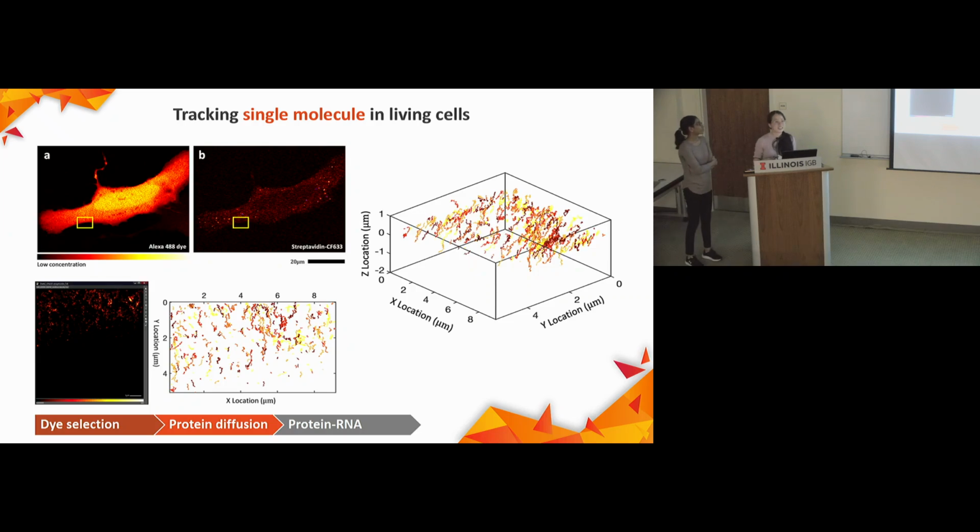Okay, dokie. I wanted to comment on your question. So they went through and did all the things they said about making sure the fluorophores are at low concentration, and that's absolutely right. There are other things you can do. When you do the search pattern, there's a lot of little ratios you can check.